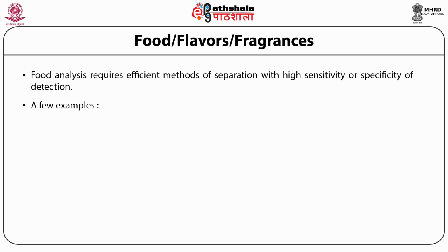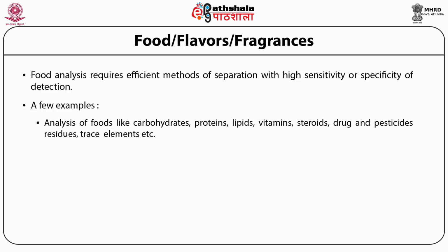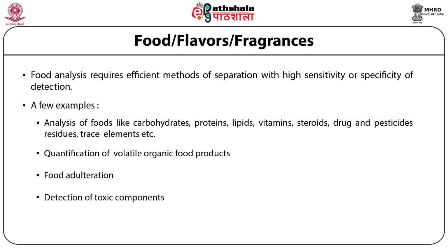A few examples are analysis of foods like carbohydrates, proteins, lipids, vitamins, steroids, drug and pesticide residues, trace elements, etc. Quantification of volatile organic food products, food adulteration, detection of toxic components.